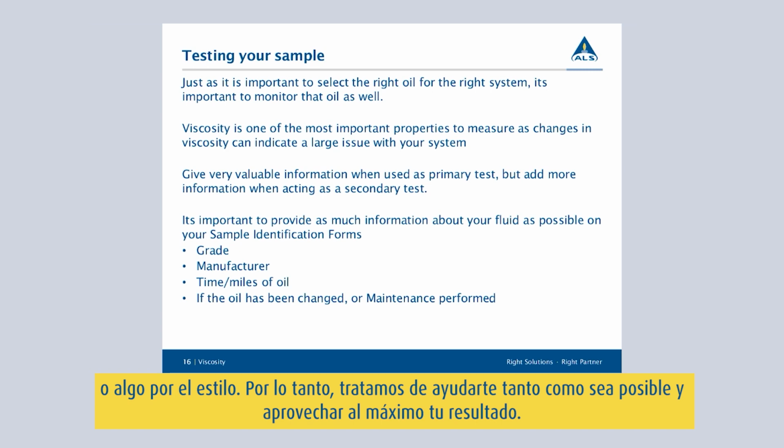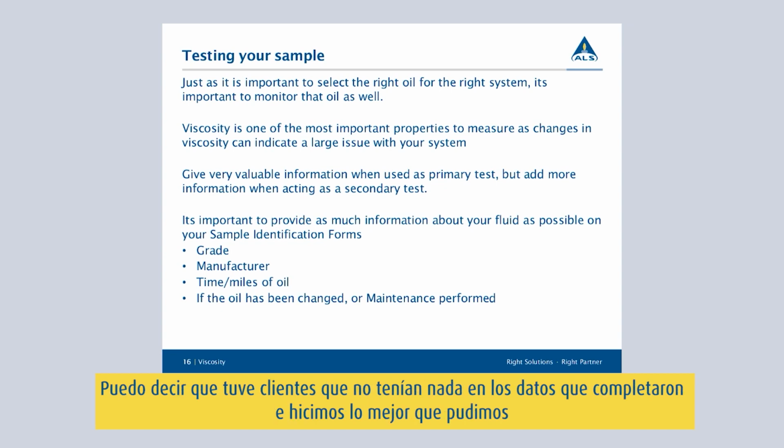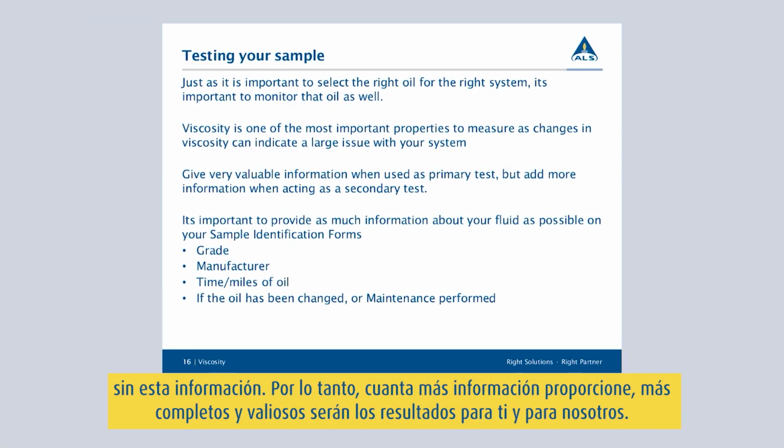So we try to help you guys out as much as possible and really get as much out of that testing as possible, because you're submitting your sample in, and the more information you provide and the more correct the information is, the better. I can tell you that I've had customers that have nothing on their SIFs and we work the best that we can with it. But the more information you provide on the system, the more valuable your results will be to you and to us.